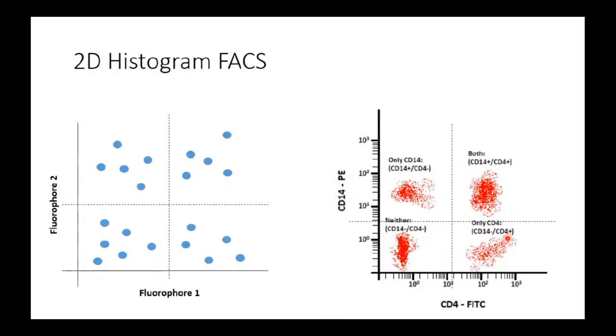As you know, in the new FACS machines we can analyze tens of proteins and tens of cells at one time. There is now one FACS machine in the market which contains 10 lasers and 30 detectors. Can you imagine 10 lasers and 30 detectors? So you can analyze many proteins and many cells at one time. But of course, the data then will be much more complex than this data. This is a very simple data.